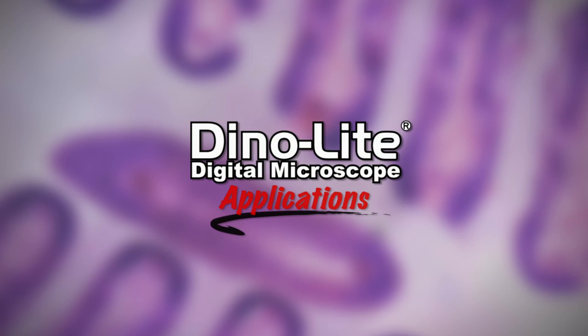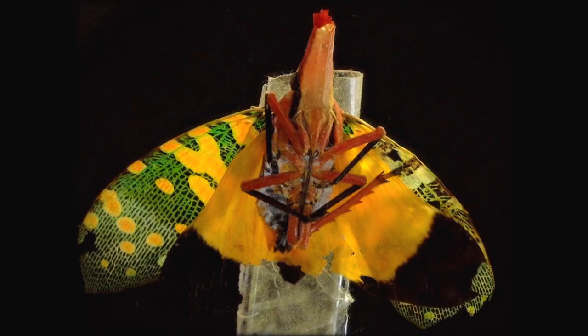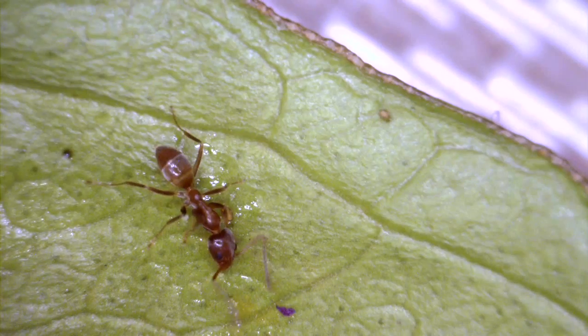This is a Dino-Lite Digital Microscope video focusing on educational applications. All of the pictures shown were captured by Dino-Lite microscopes. In this video, we'll introduce the Dino-Lite, its features and results, show how it's used, and some of the available options including Dino-Lite models and accessories.